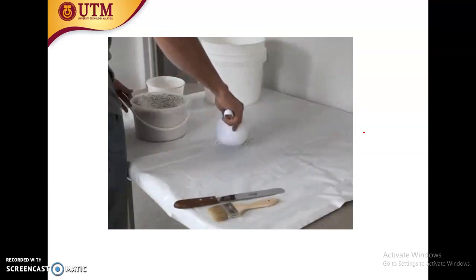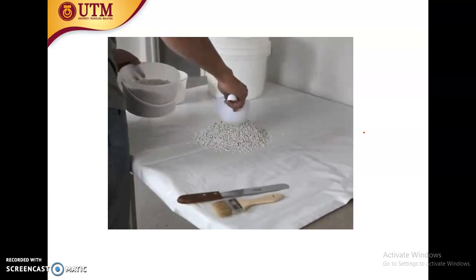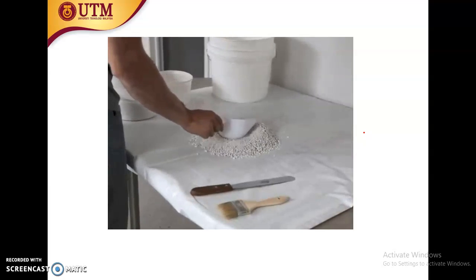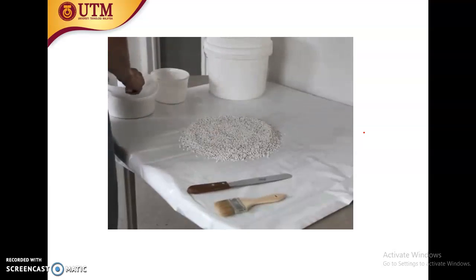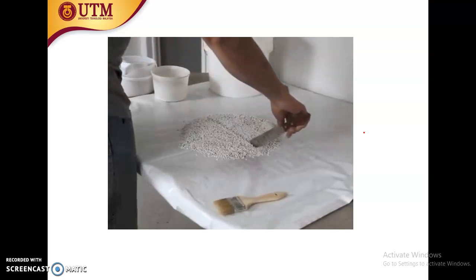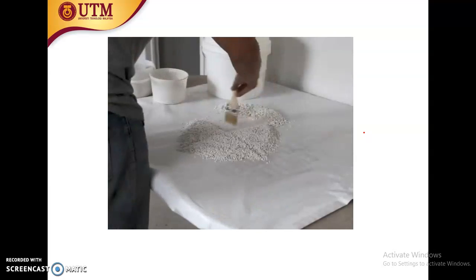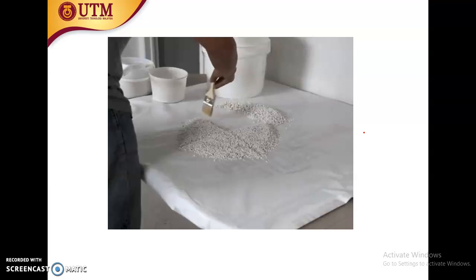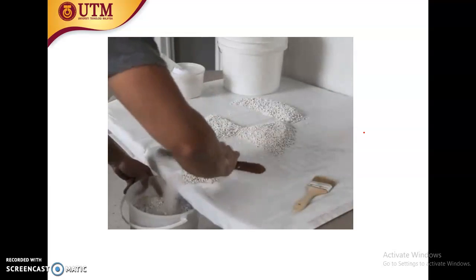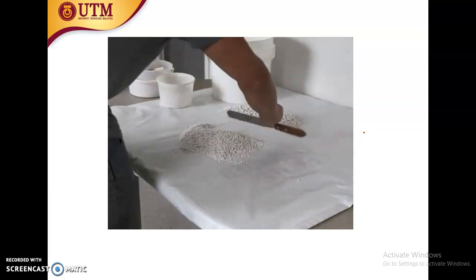Pile the sample in a cone shape by placing each scoopful or pouring each bucketful at the center of the cone so that the perlite will disperse equally in all directions. This is perlite sample. So this is inorganic sample containing inorganic analyte. You see that the size of the perlite sample reduces every time he does the coning and quartering. See, remove. So this is to make sure homogeneity, to make sure the fairness in terms of sampling.